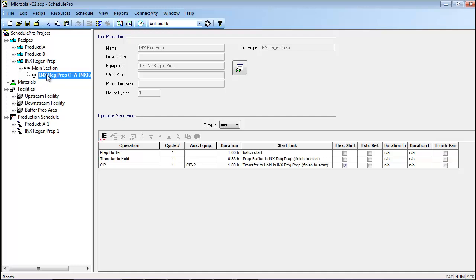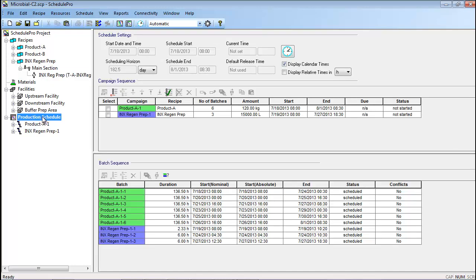There are several ways to specify when the INX regen prep recipe should be run. The simplest way is to schedule individual campaigns of the INX regen prep recipe whenever additional buffer is expected to be needed by the production campaigns. For instance, if one buffer prep recipe can feed two batches of the production recipe, a single buffer prep batch could be scheduled prior to every two production batches within the campaign sequence area of the production schedule. Another option is to link production and consumption of a material such as a buffer by using a storage unit. This can allow additional batches of buffer to be scheduled automatically whenever more buffer is required by the main process.